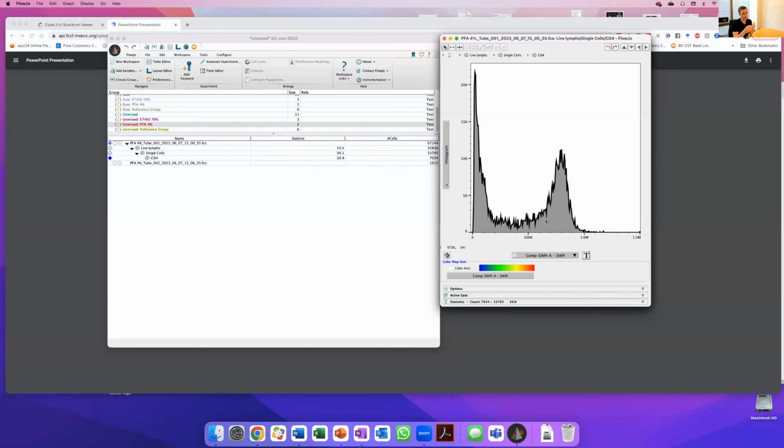Maybe it was a problem there, or maybe a problem with not enough DAPI here to be able to stain all the cells, right? So now, if you're asking the question, well, but maybe this is G0, G1, and this is the G2 and S phase. Here it's obvious that it's not, starting with the issue here that if it was G0 or G1, the G2 should be 2 times the amount of DNA, and you can see here that this is 500, this is 1 million.